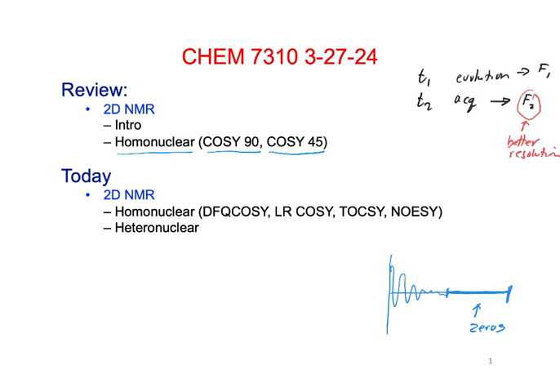I was reading this morning that this is oftentimes also called a COSY beta. And like we saw in this COSY beta, it narrows down the spectrum near the diagonal. Some of these experiments that narrow it by the diagonal do that also by changing the peak shape.